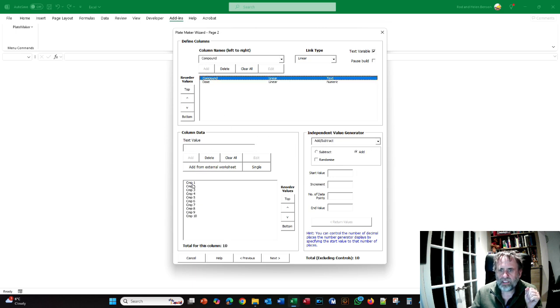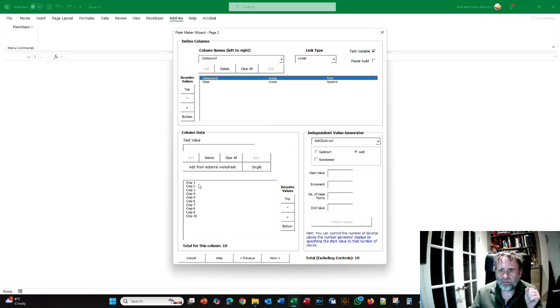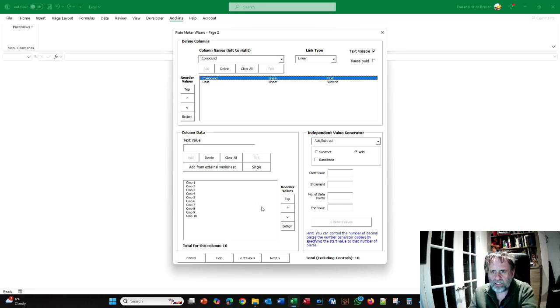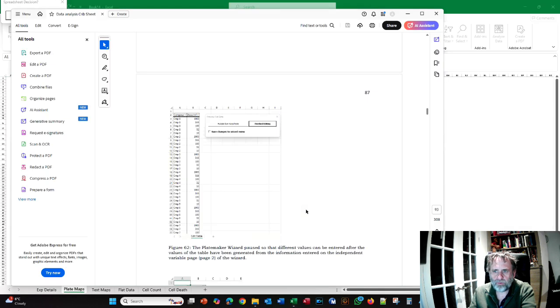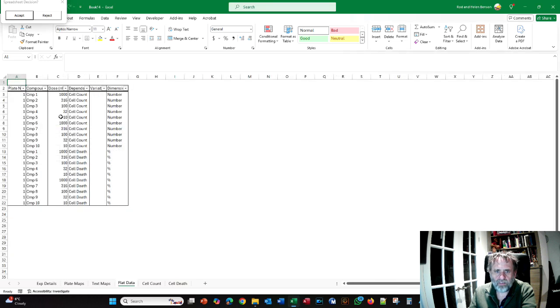So literally it takes compound 1, dose 1000, compound 2, dose 316, compound 3, dose 100, and so on and so forth. It's literally just doing that, and this is why we end up with only 10 samples, because effectively what it is doing is it's gone compound 1, 1000, it gets all the way through the first 5 doses, and then compound 6, it's now run out of doses, so it just simply cycles them again.